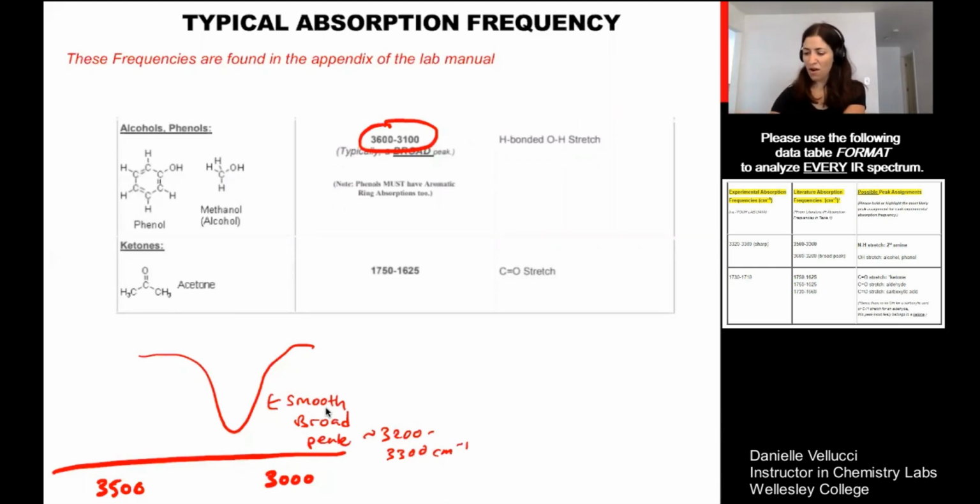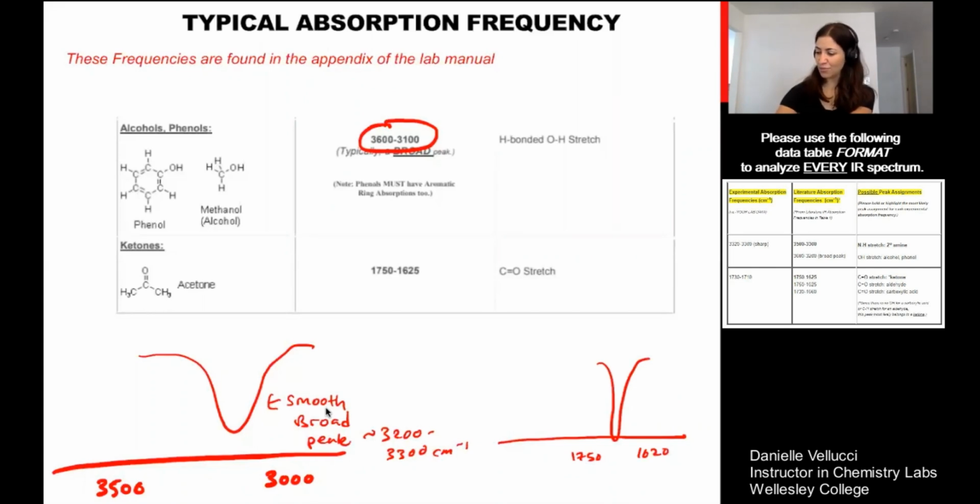Okay. For aldehydes and ketones, as we saw in the previous slide, between about 1620 and 1750, I should also see a prominent clean absorption signal. And these typically will even be down towards like 20 or 30% transmittance. These are very strong absorptions in the IR spectrum.